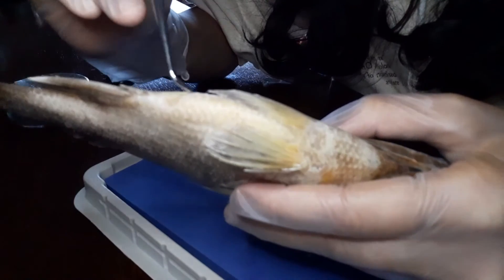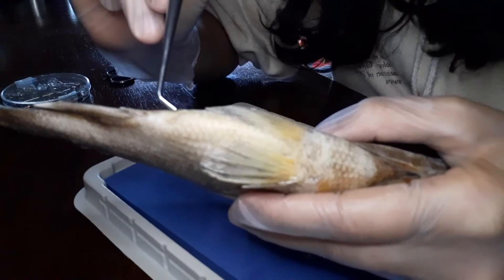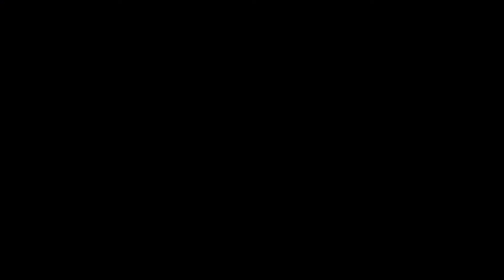And finally, here is the anus. It's where the fish poops. I don't think you want me to show you a picture of that.